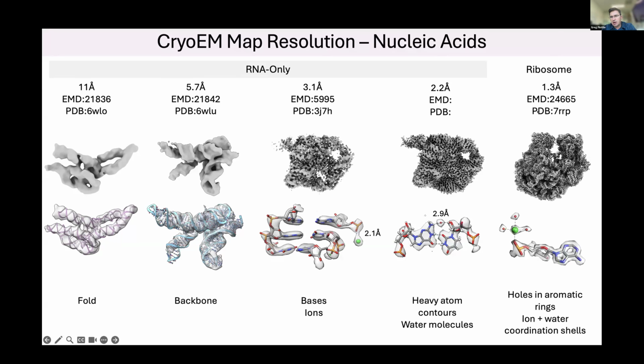And the highest resolution for RNA is a ribosome. And here you see the donut-like aromatic rings. So very, very good definition.